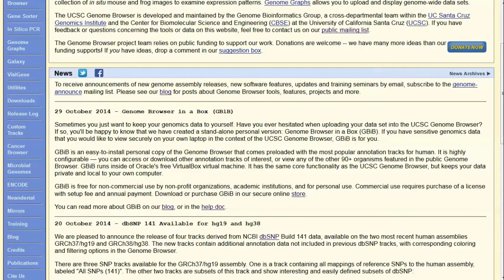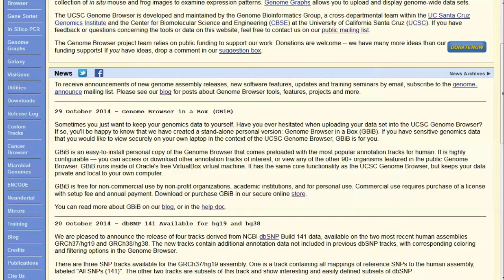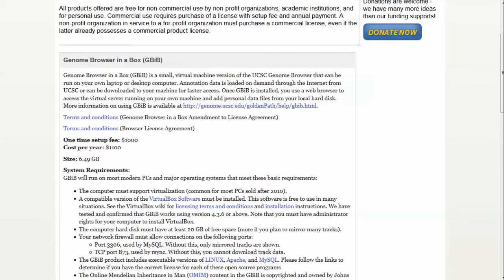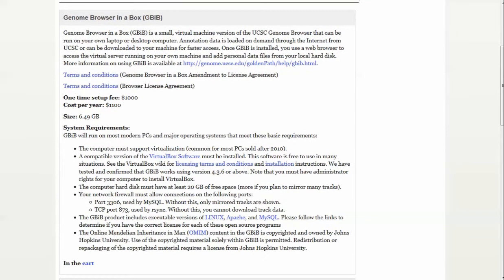If you're going to want to install the Genome Browser in a Box, you go to the online store here. You would then be able to purchase or obtain the UCSC Genome Browser in a Box. You can learn about the system requirements here.